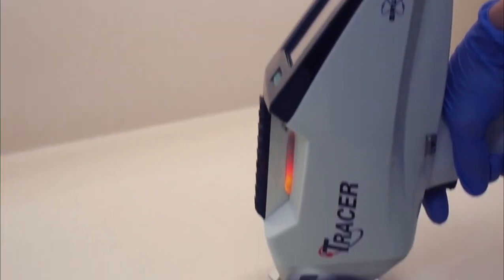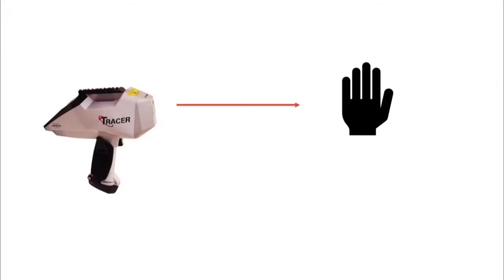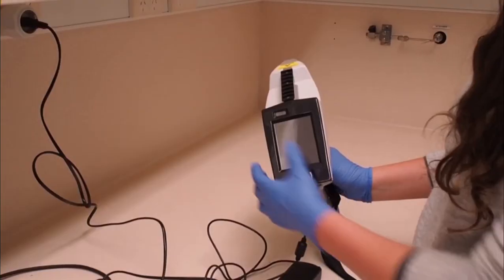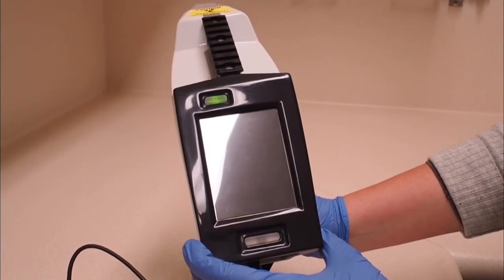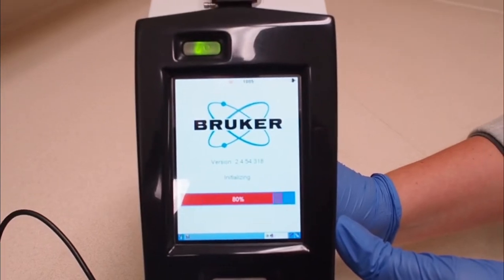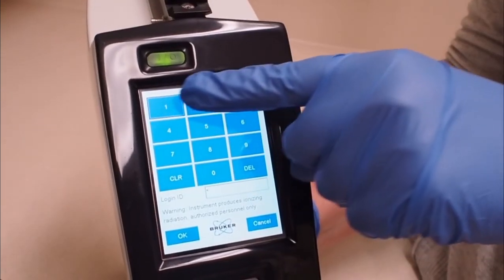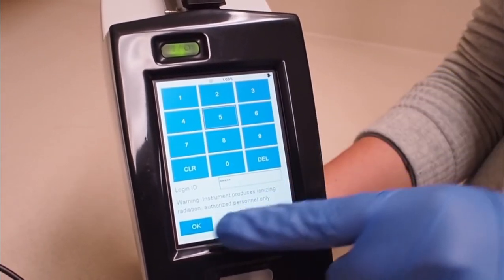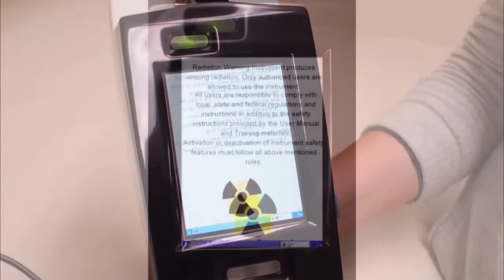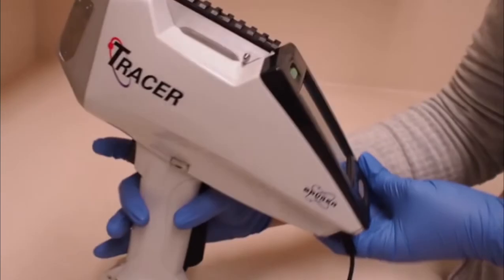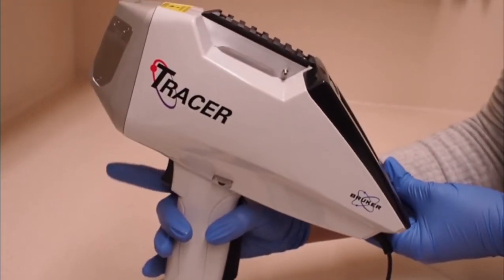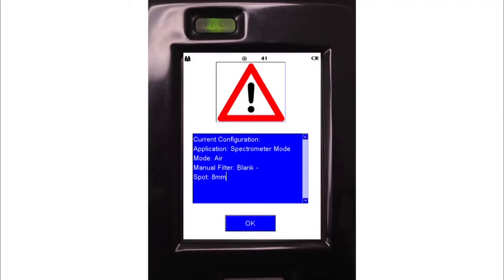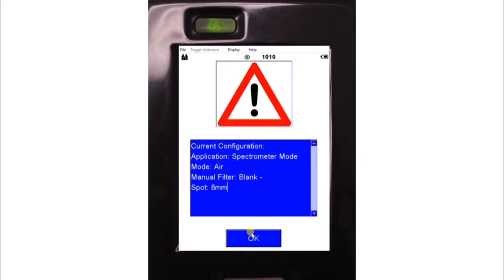The tracer is most often operated hand-held but can also be operated remotely from the instrument computer. To operate the instrument hand-held, hold down the power button on the top right of the instrument screen and wait until the Bruker software, pictured here, has loaded. To log in, enter the password 12345. A window will appear with an ionising radiation warning and you need to pull the instrument trigger to proceed. The current configuration will then appear on the screen. Click OK to proceed.